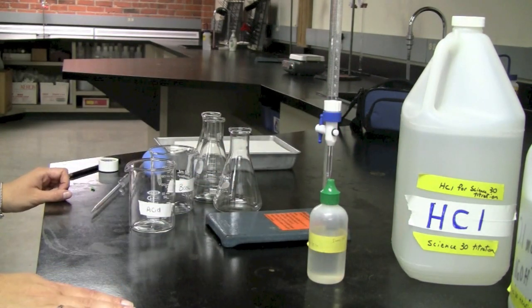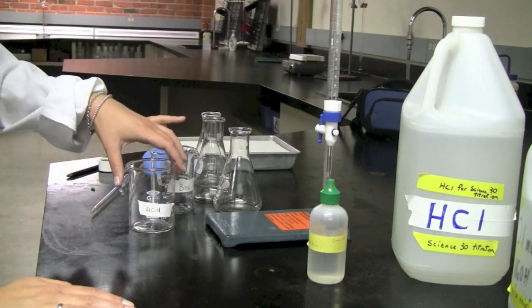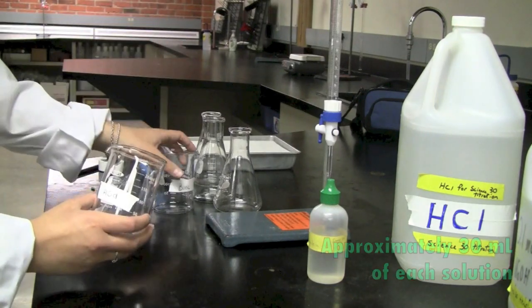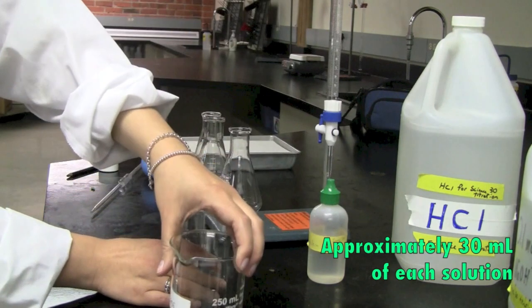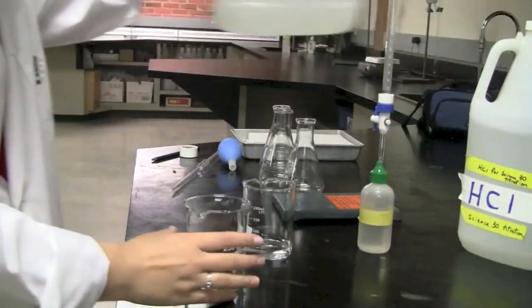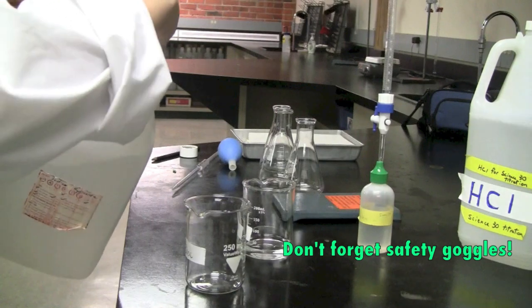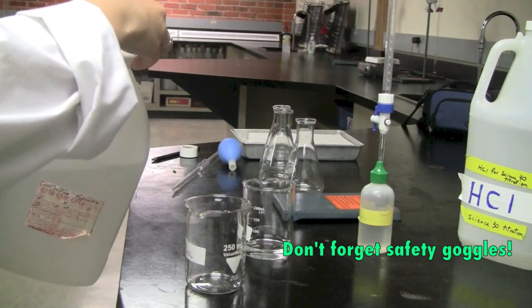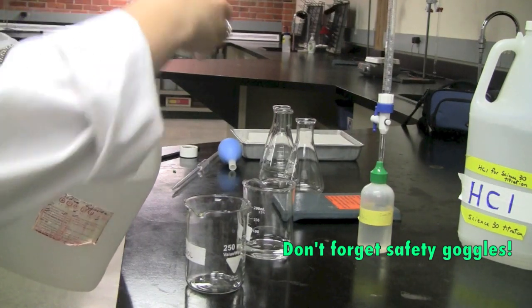First, what you're going to do is you're going to take your two beakers, one labeled acid, one labeled base, and you're going to obtain 30 milliliters of each solution. Because you are dealing with acids and bases and chemicals, you need to be very careful in terms of when you're pouring it into the beaker.